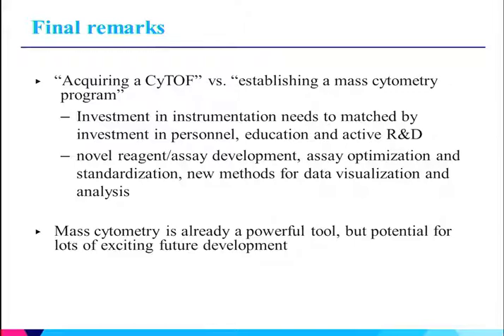So that's just an example of some of the kinds of things that go into developing some of these experiments. The next step that we're doing with Cecilia's experiments is to try and improve sample throughput and manage costs better by taking all of this and incorporating a barcoding strategy so we can multiplex samples and do larger patient cohorts. But I don't think I have that much time to go into that aspect of things.